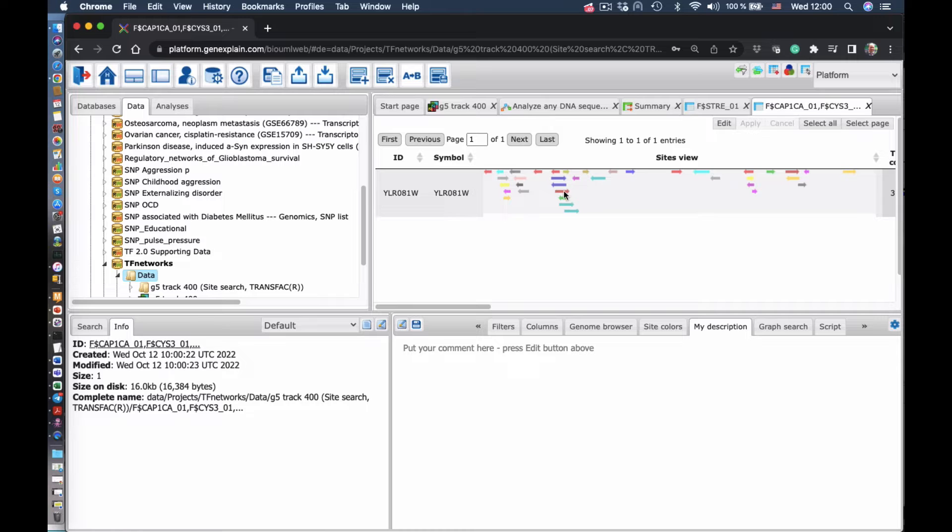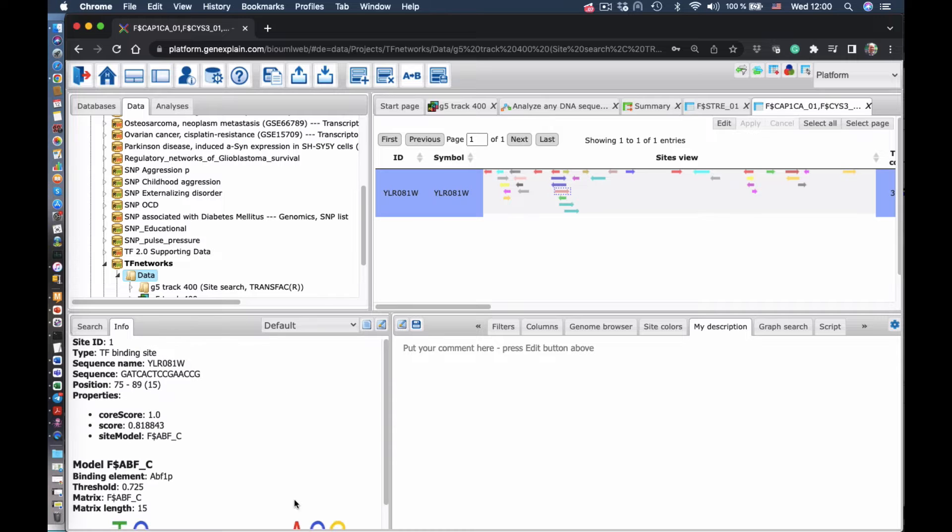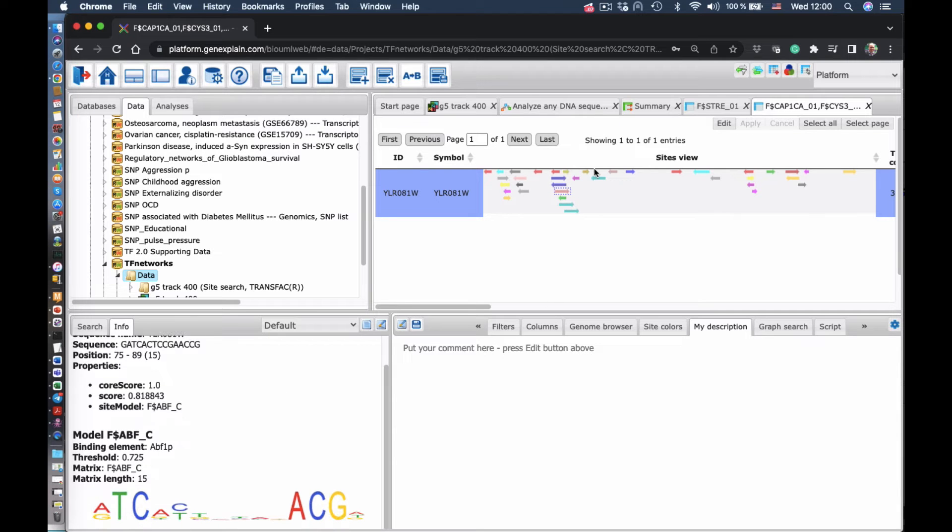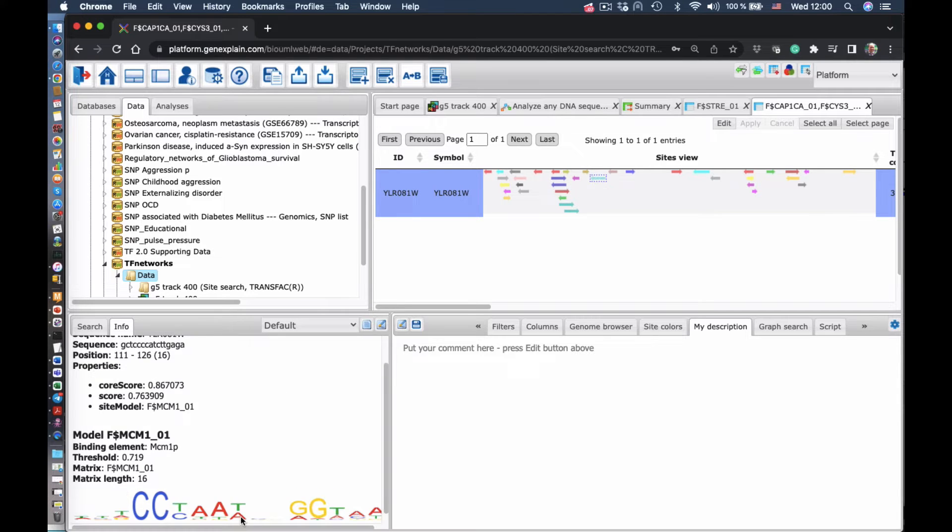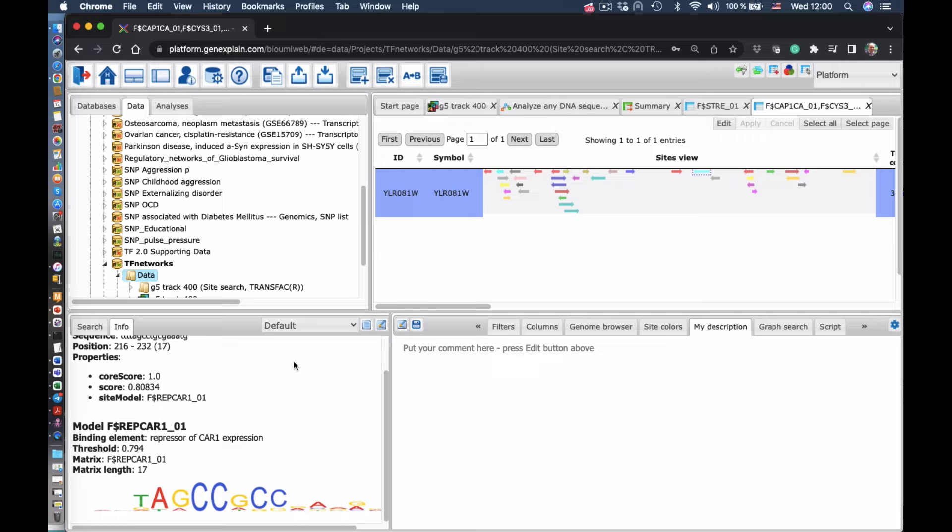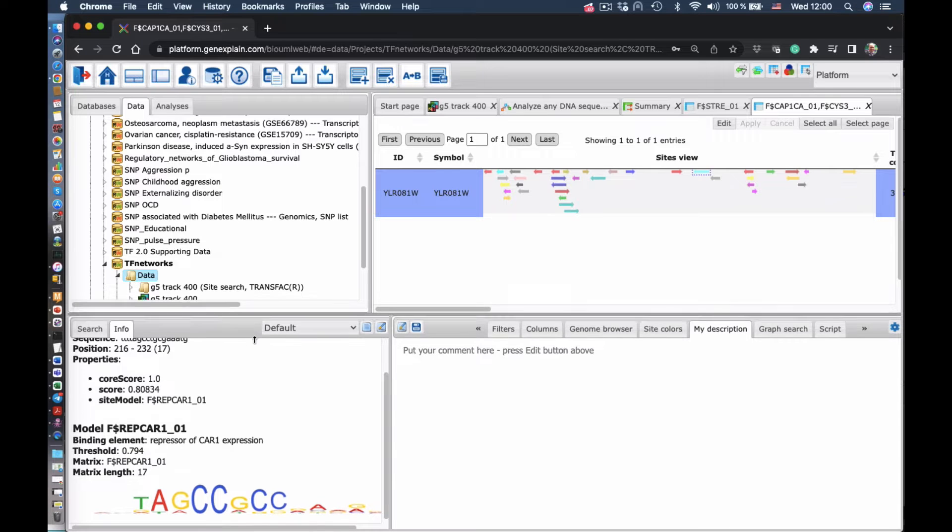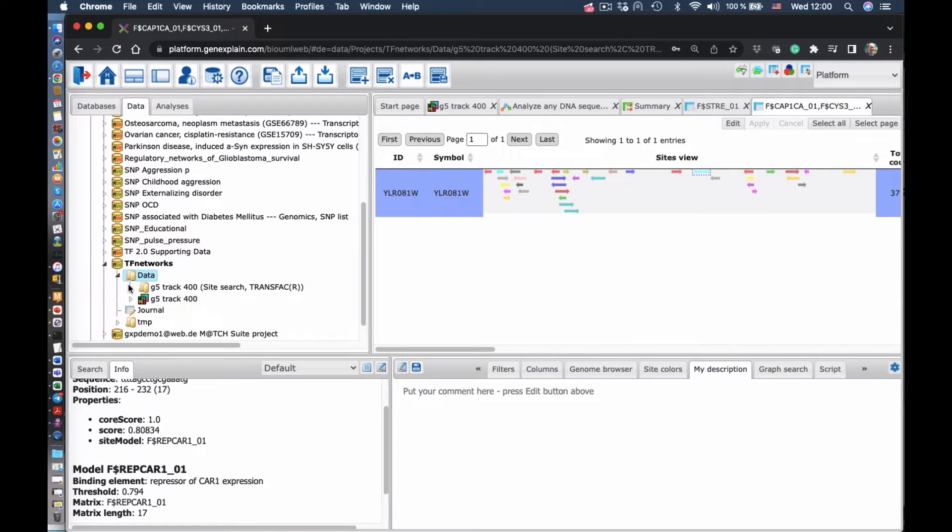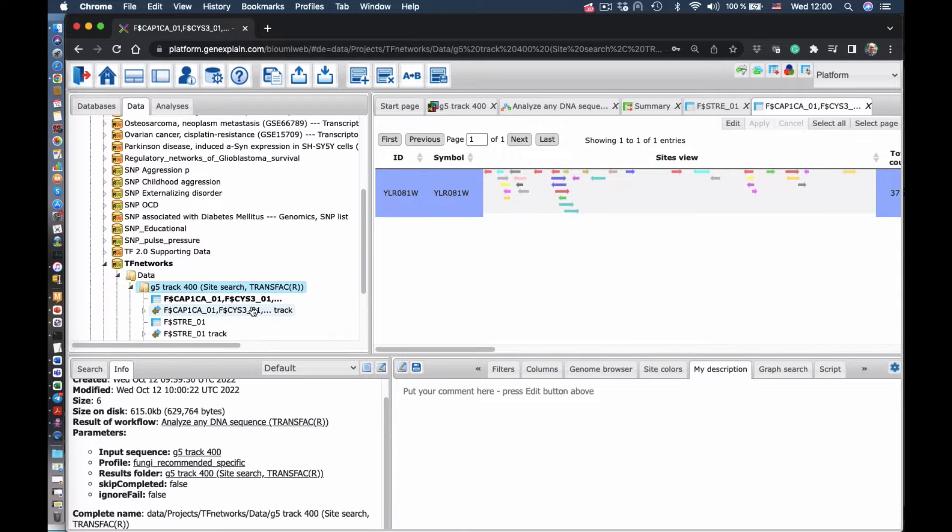So we see those colorful arrows are different sites found in the promoter of that gene. So we can click in each of the sites and see the information.